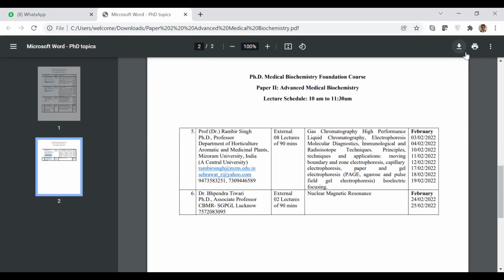So we use chromatography to separate the components in certain solutions. Now, what is the application part of it? It is used while detecting certain solutions in some samples. Okay, now what is its application in biochemistry? Sir, I have done some experiments on HPLC in my college.